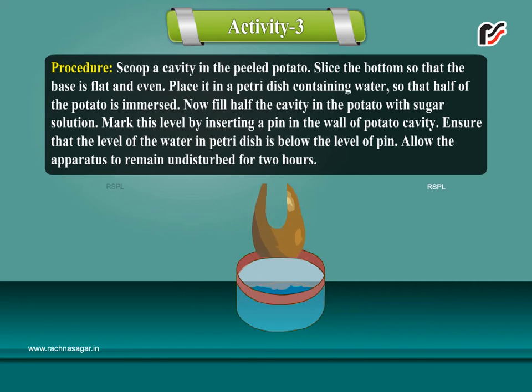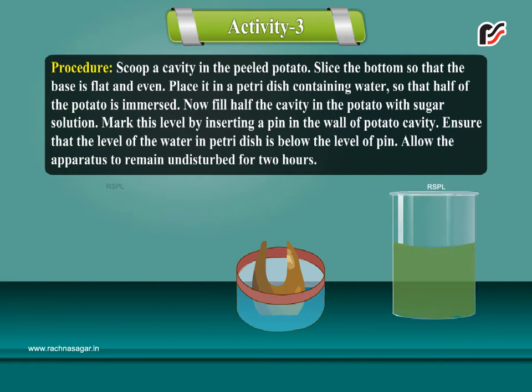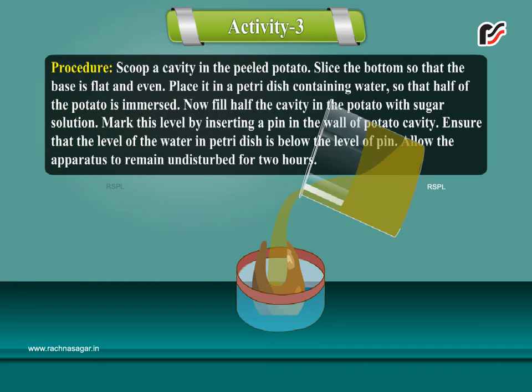Place it in a petri dish containing water so that half of the potato is immersed. Now fill half the cavity in the potato with sugar solution.